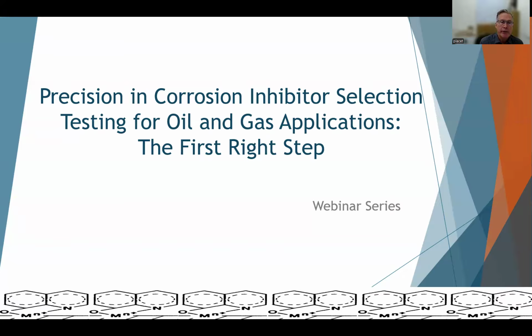But how do we faithfully depend upon that information without knowing either the pedigree of the test or the pedigree of the laboratory? So here we are talking about precision in corrosion inhibitor selection as the first step in testing inhibitors for oil and gas applications.